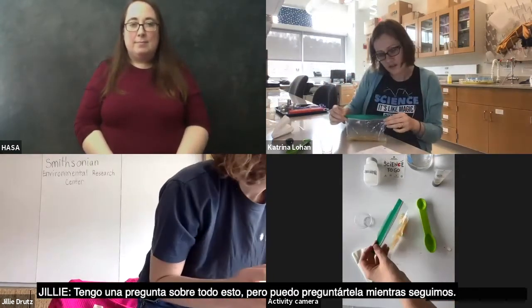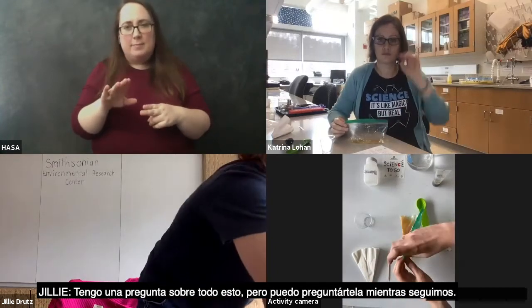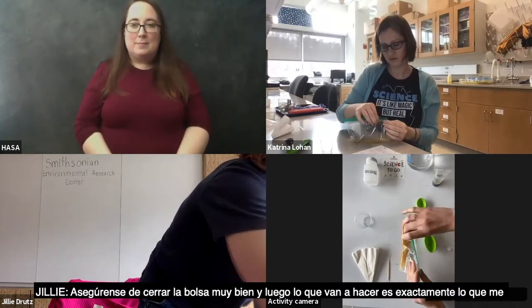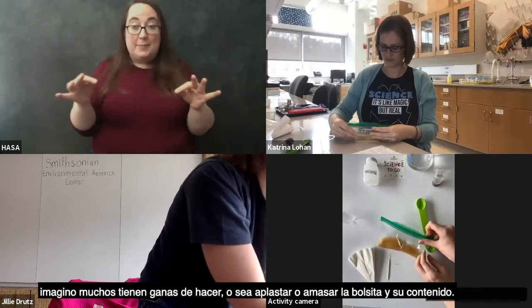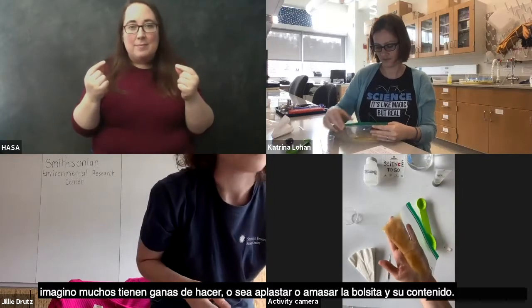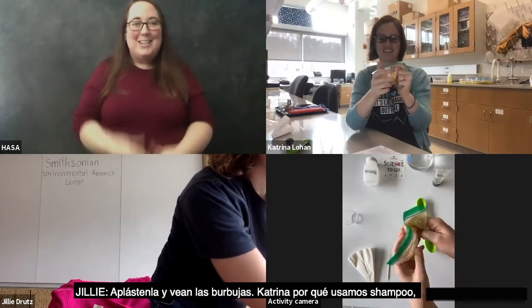Yes. So... Wait, really quick, why? Well, actually, let's do the next thing, and I have a question about this, and I can ask it while we're doing it. Okay. So make sure you close your bag nice and tight, and then what you're gonna do is exactly what you really want to do, which is smush this. Smush it all up. Watch all the bubbles.